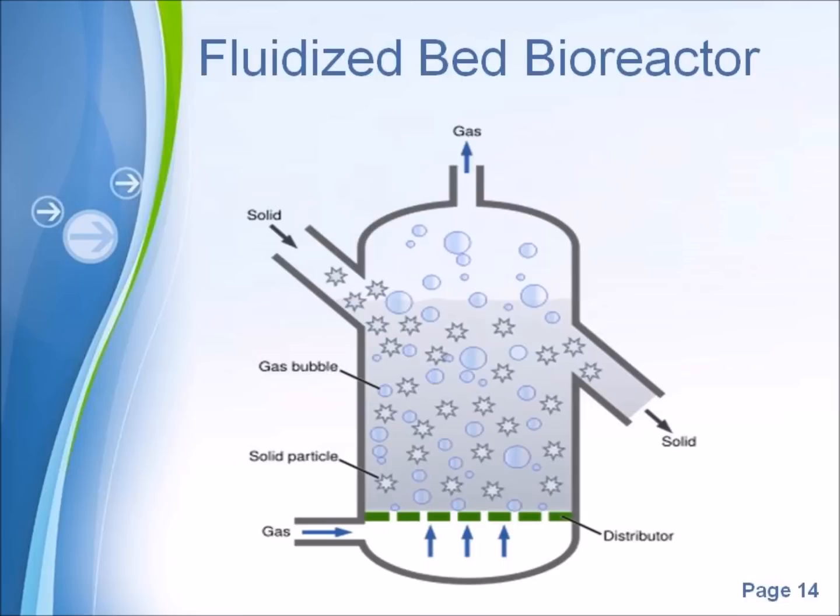On fluidization, the smaller particles rise relative to the larger particles, and produce a situation where the smaller particles are at the top and the larger particles are at the bottom of the bed.